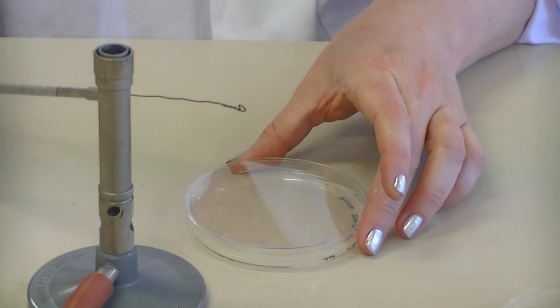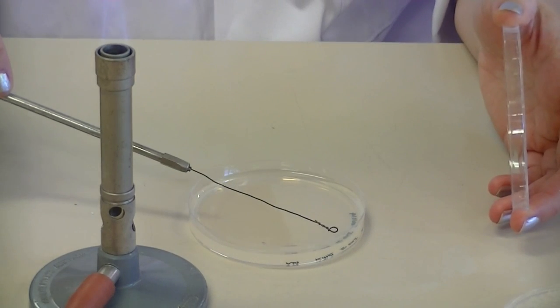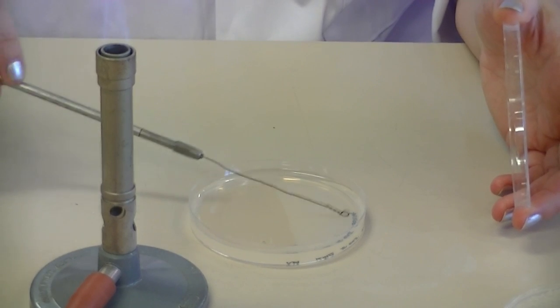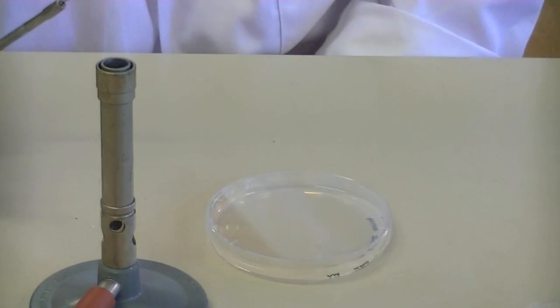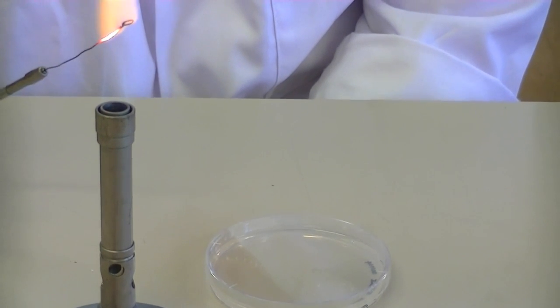Now I have my colony on my loop — I'm going to perform the primary streaks. You move your loop with the bacteria on it back and forth onto the surface of the agar. That has to be done very gently so that you don't tear the agar. The agar is hard, but it is like a jelly substance and it can easily tear.